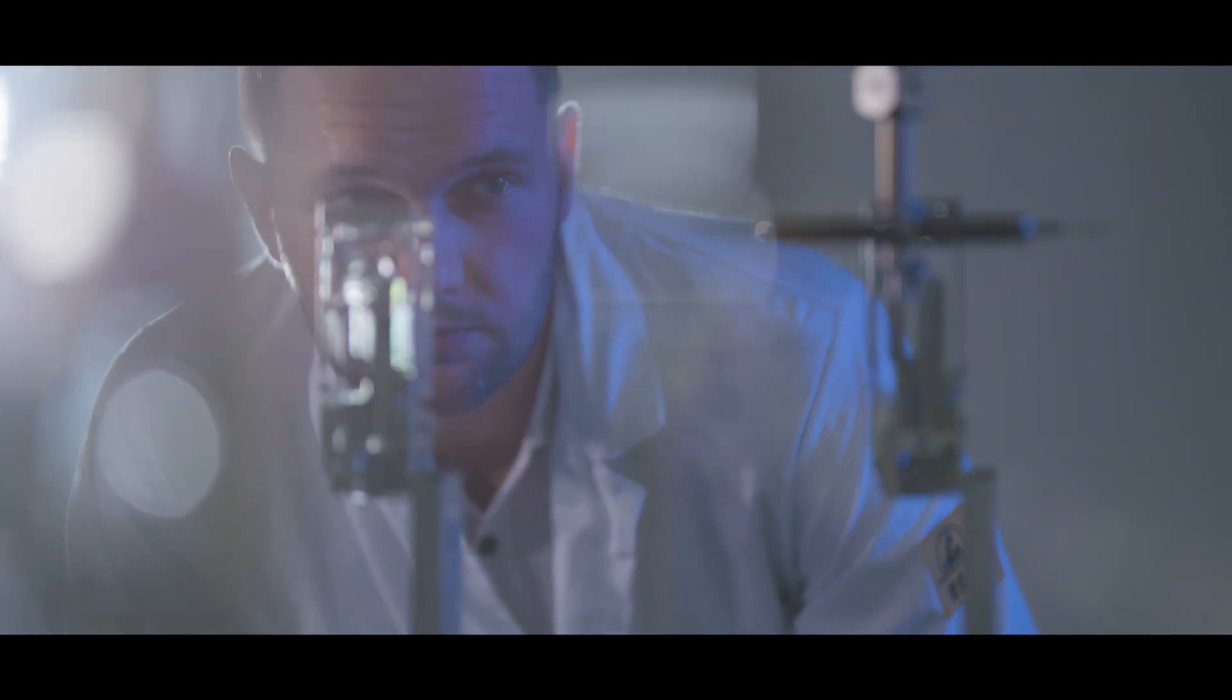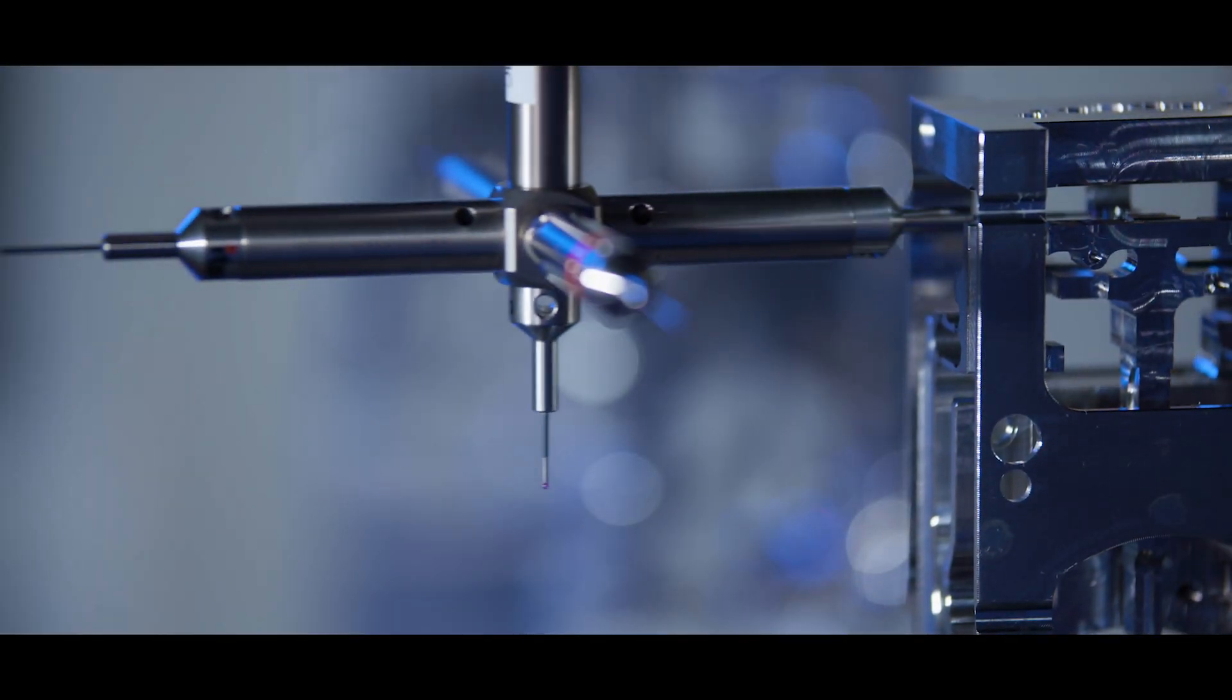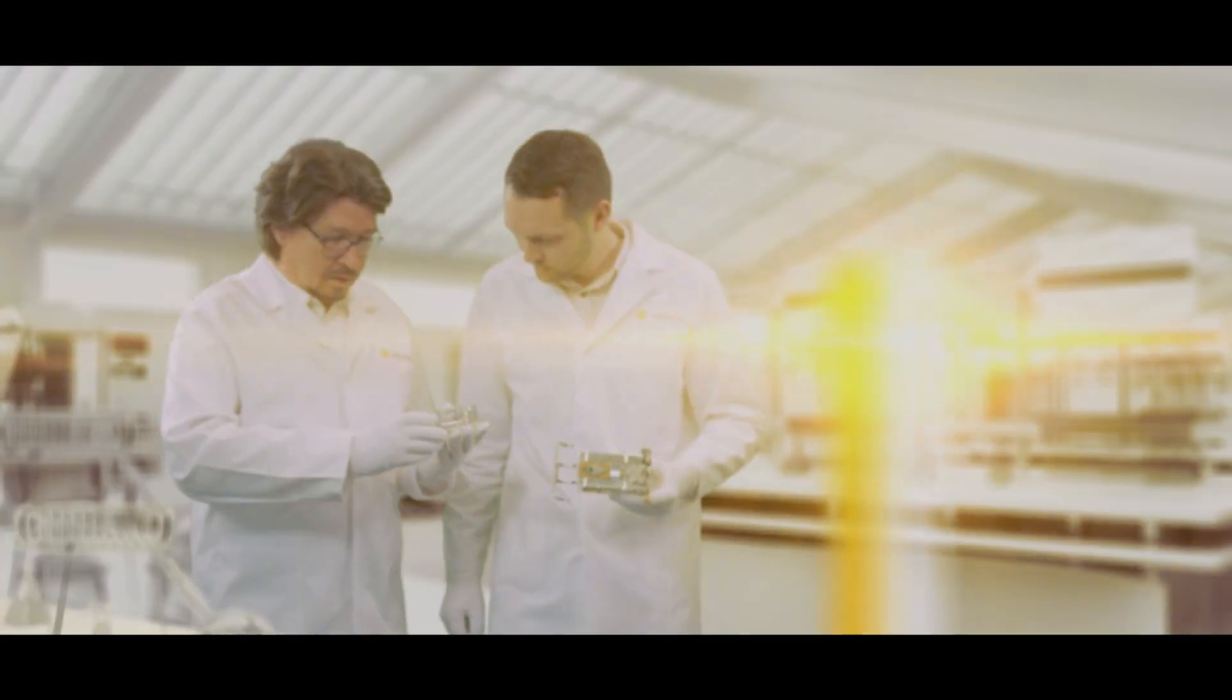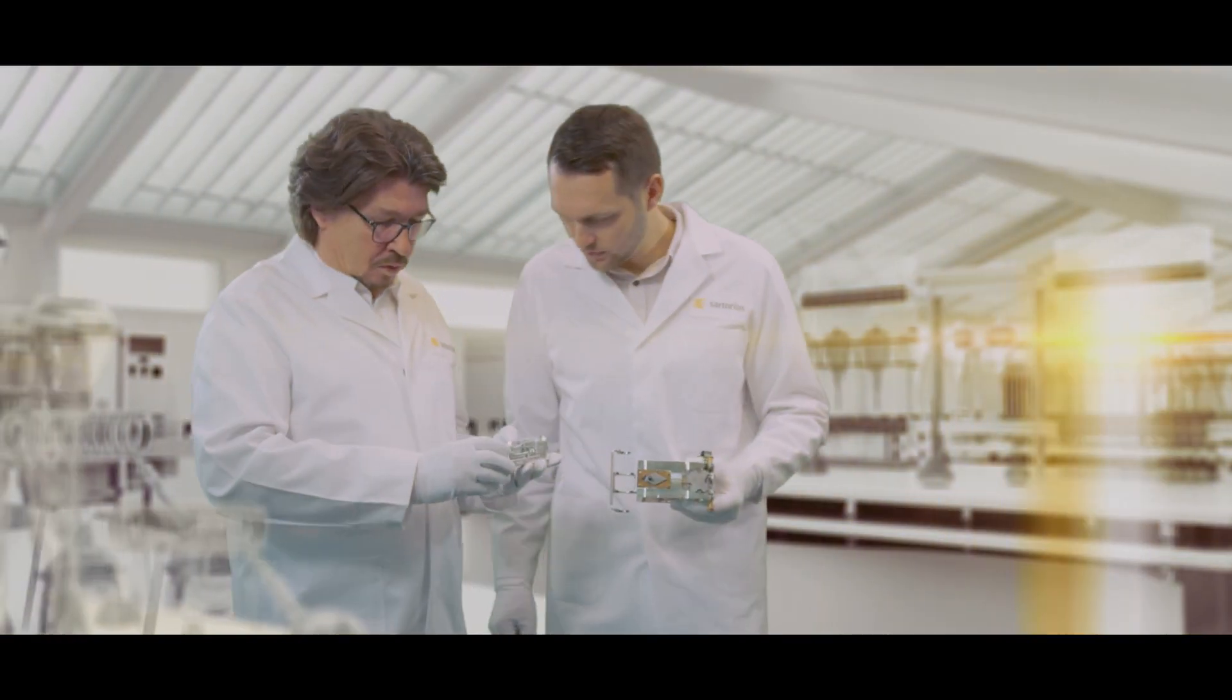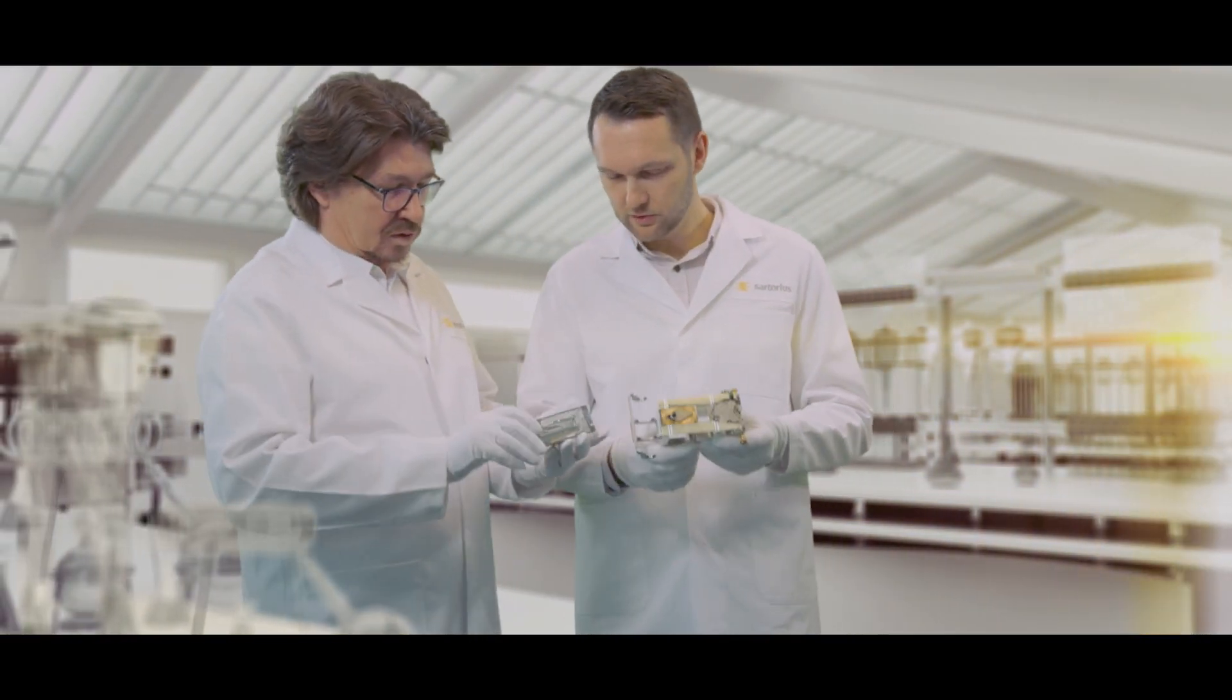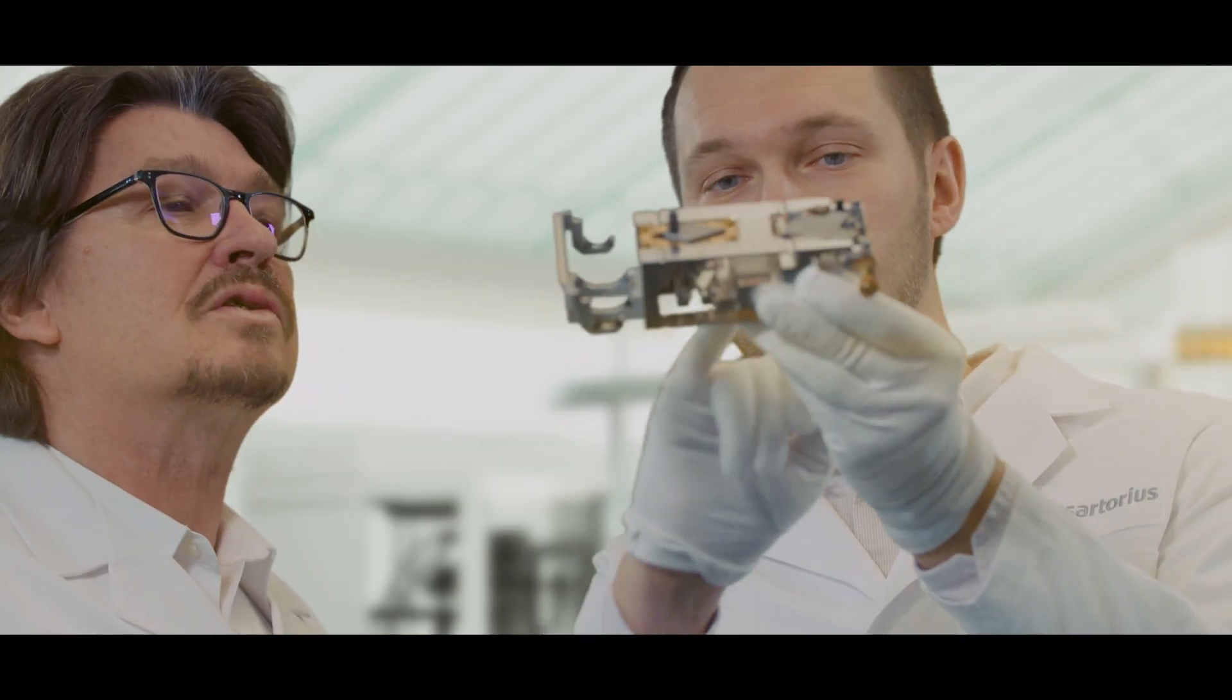To address the increasingly complex requirements for reliability, precision, integration and compliance. From the very beginning, Sartorius instruments have continuously set new standards in the world of weighing technology.